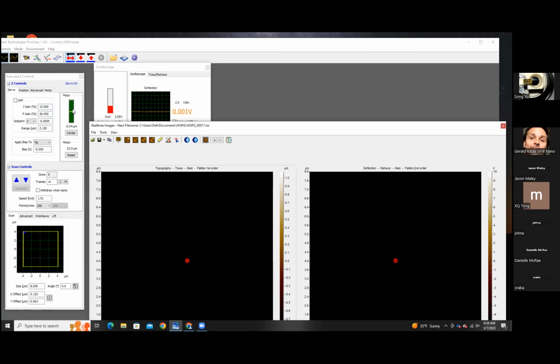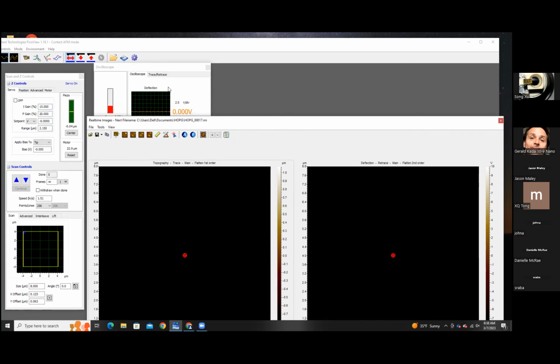It's probably 200 nanometers higher than the middle. If it is STM, the tip is already probably crashed. So yes, AFM is much more forgiving. And then you click this button, which shows that it's scanned down. Click that. And then your image starts.